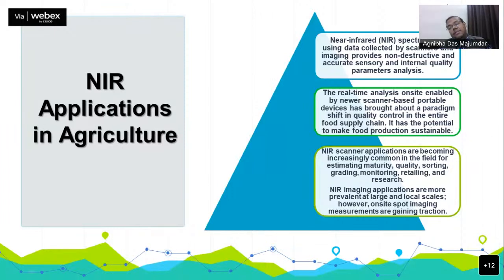So the primary data has been collected from the near infrared spectrometer, and with that data we can develop a model as a non-destructive technique, giving accurate results as we can get from the destructive, traditional analytical techniques. Like, if we want to know the fat content present in any fruit, in my PhD work, I wanted to know the fat content in mango pulp. There was a traditional method, the Soxhlet method. Chemistry or food science people know this method very well.